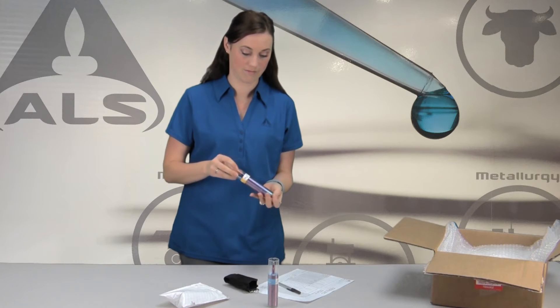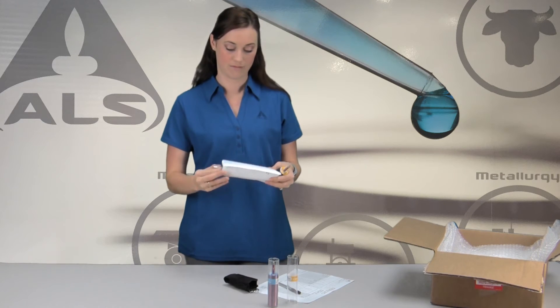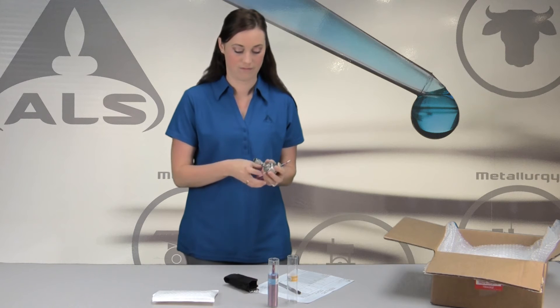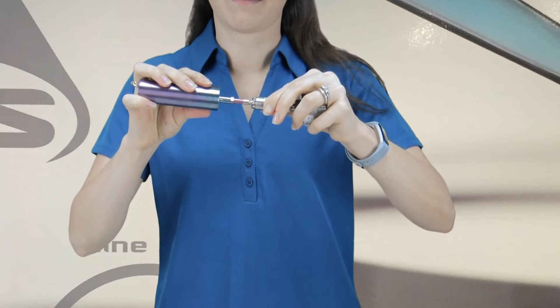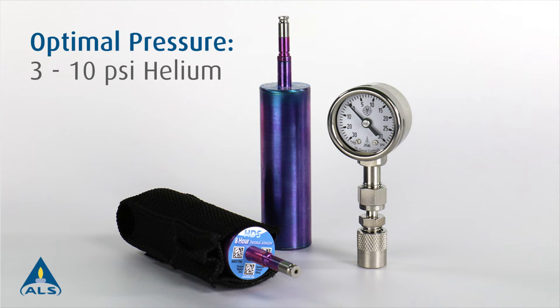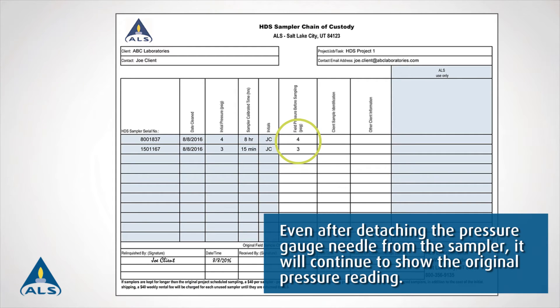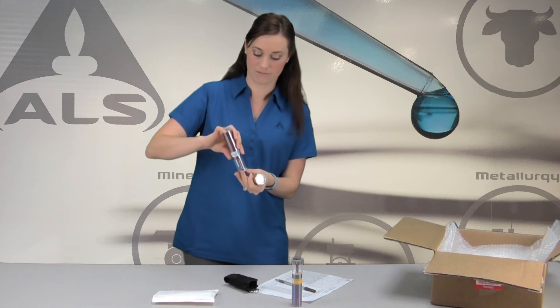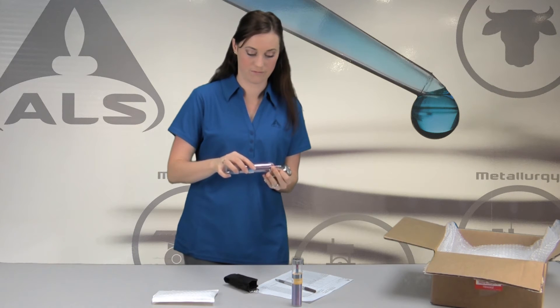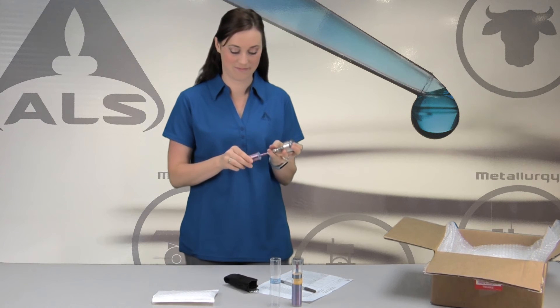Prior to sampling in the field, confirm that each HDS sampler has positive helium pressure. Using the enclosed pressure gauge, insert it using the Quick Connect on the top of the HDS microvalve. The pressure reading should be between 3 to 10 psi of helium. Measure and record the pressure on the chain of custody form at the time of sampling as proof of sampler integrity. The pressure gauge can be used to verify additional HDS samplers, and the pressure reading will fluctuate as you attach it to each additional HDS sampler.